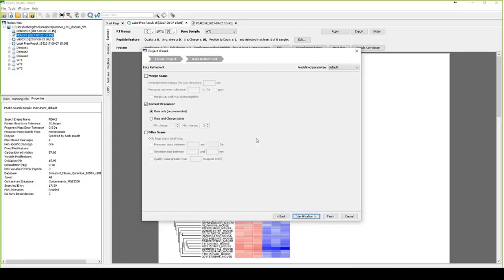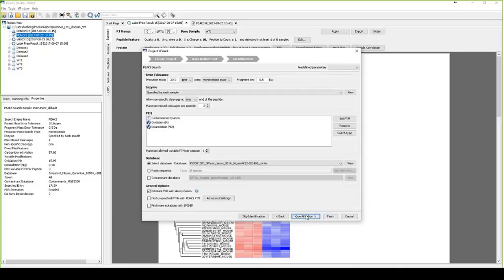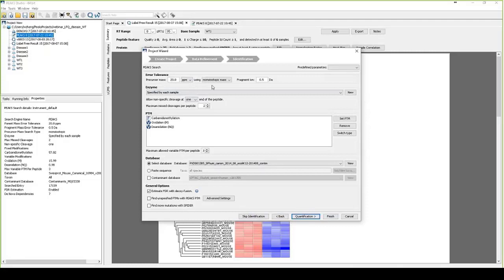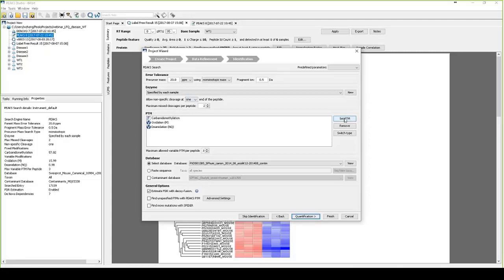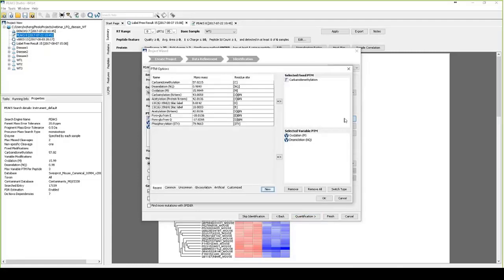In this setting, usually no change is needed, and I just use the default setting. And then you go to the identification setting window. Here, since the MS1 was measured in the high-resolution Orbitrap, I usually put 10 to 20 ppm as the MS1 precursor mass tolerance. And the MS2 was measured in the ion trap in this dataset, which doesn't give you very high resolution, so 0.5 dalton should fit the data. And I have allowed two miscleavages on one end of the peptide for identification.